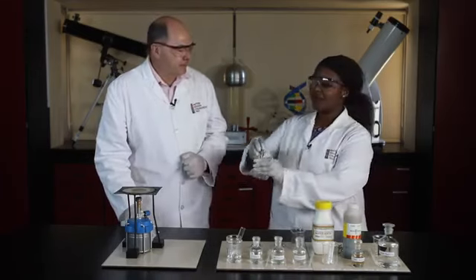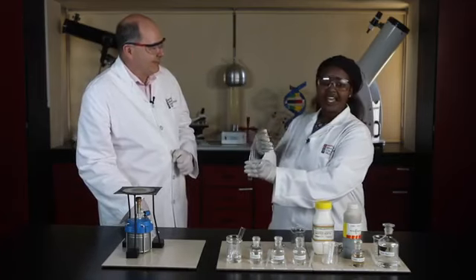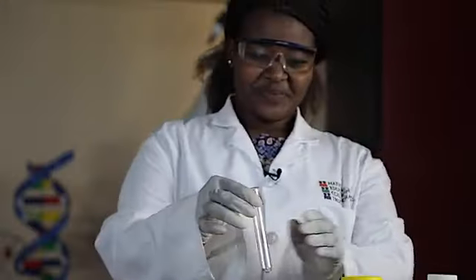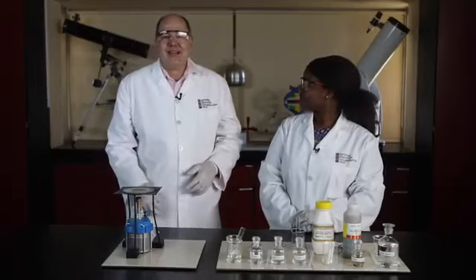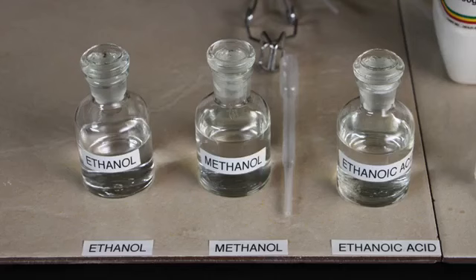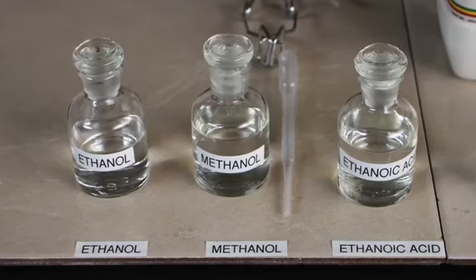So, we waft the odor of the substance gently towards us and take a sniff of the fragrance. Right, we are ready to make the first esters. We are using ethanoic acid reacting with ethanol in this first investigation.